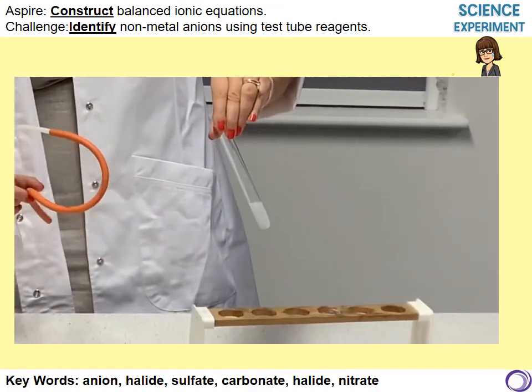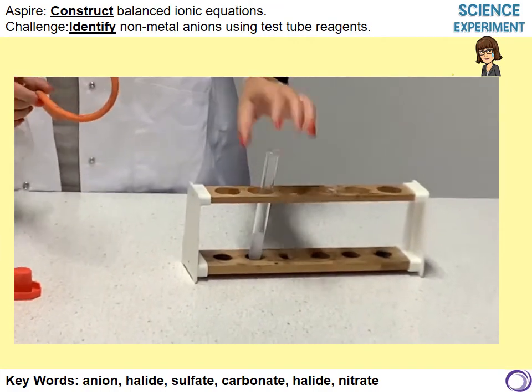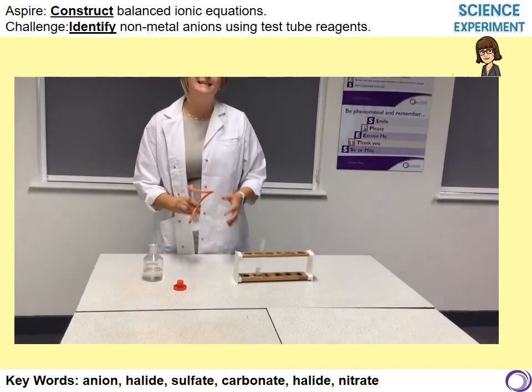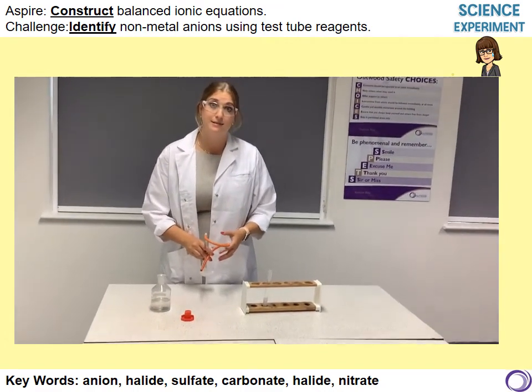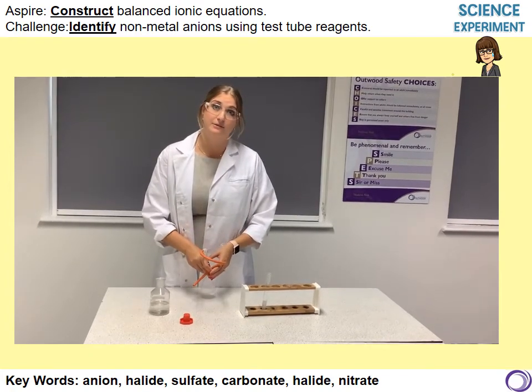Sometimes you could be asked to identify both the metal and the non-metal ion in an unknown sample. So you would have to use a series of these tests to make sure that you identify both of those types of ions.